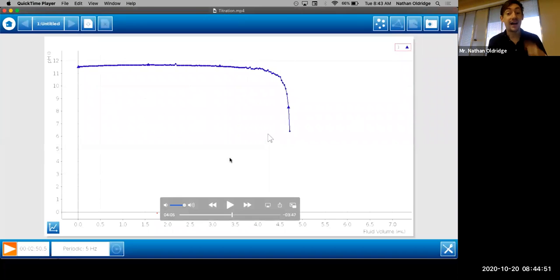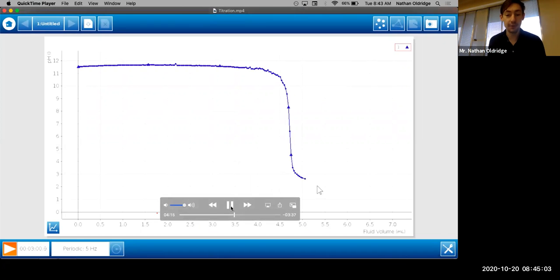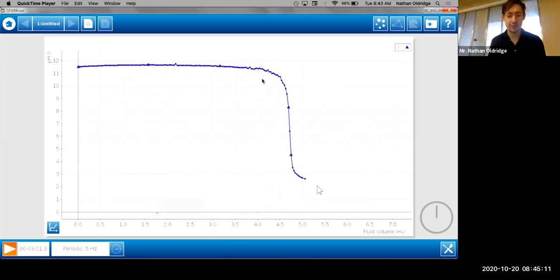the amount that you need to make a pH change of 1 gets exponentially smaller each time. Eventually, you get to a point where you've added the exact same amount of acid as base. I'm talking about the number of H pluses and the number of OH minuses. That point is called the equivalence point. It means you've added equal numbers of moles of H plus compared with OH minus. The equivalence point of a strong acid and strong base is going to lead you to a pH of 7.